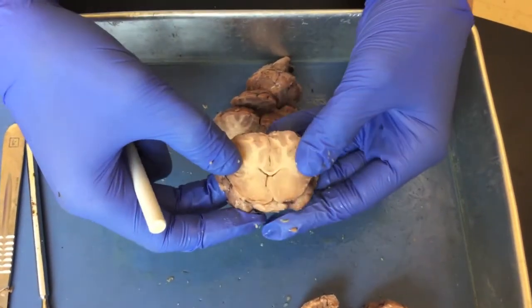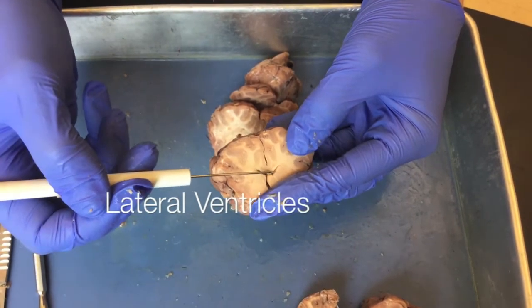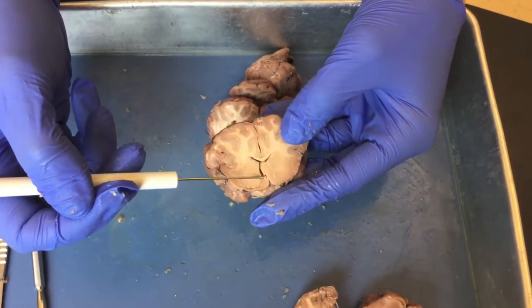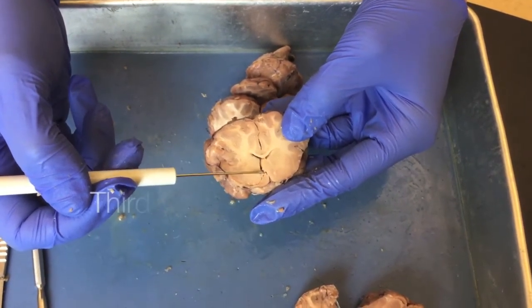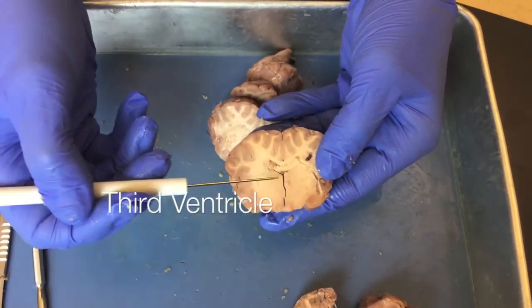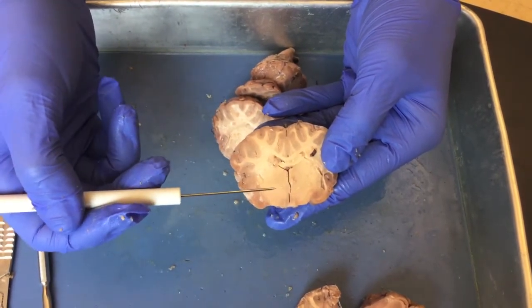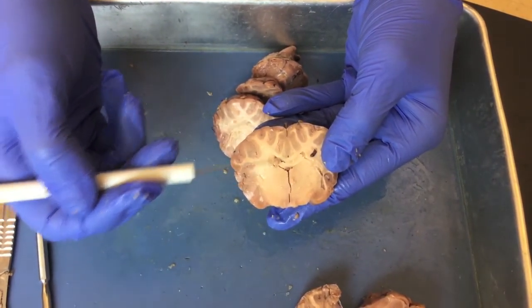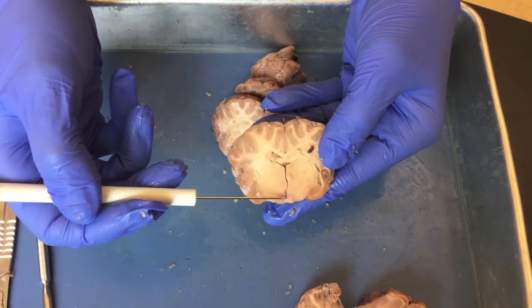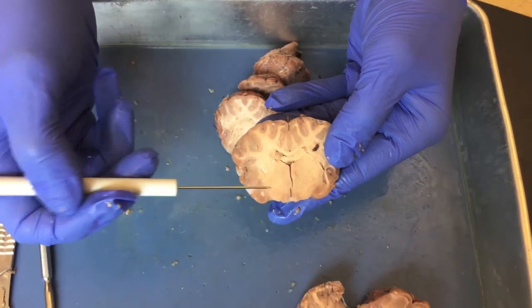Moving further posteriorly, we can now begin to see the lateral ventricles and how they can begin to communicate with this central third ventricle. Moving further posterior, you can see the third ventricle on the midline. This is why we couldn't see the third ventricle in the mid-sagittal section, because we made that cut straight through here. But now you can see it in this coronal section.